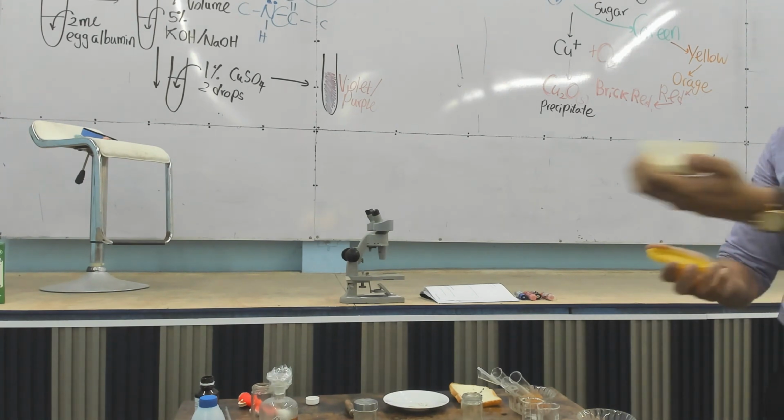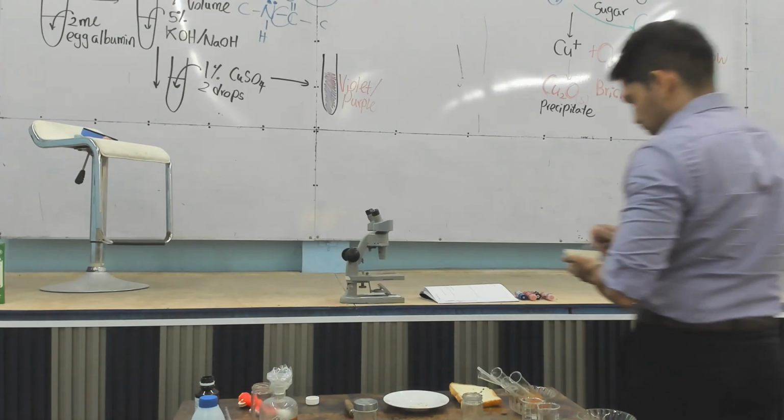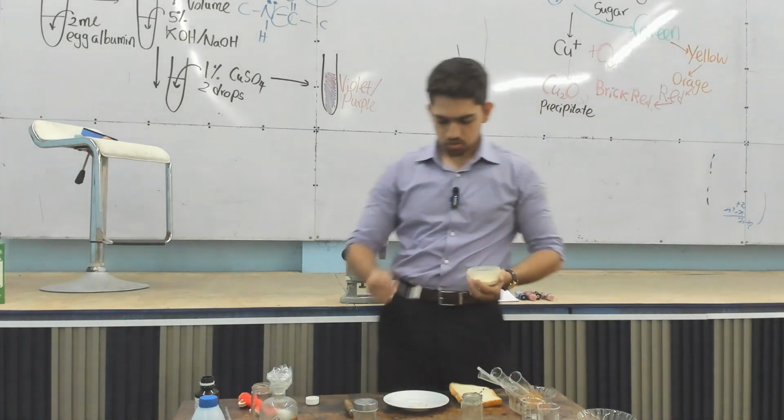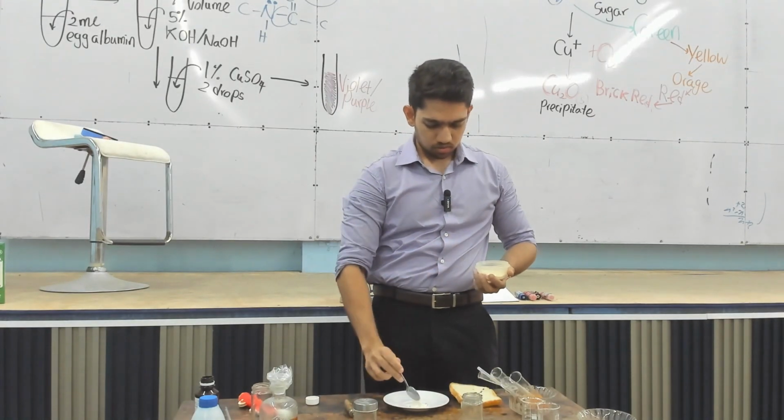So this is palm piti, okay. So we take a bit of starch, that is your normal wheat flour, right?